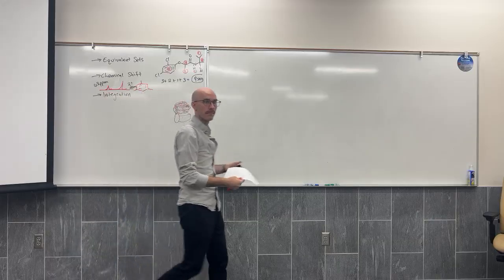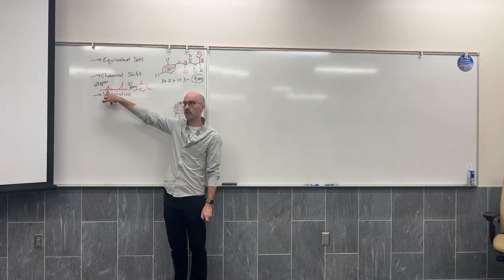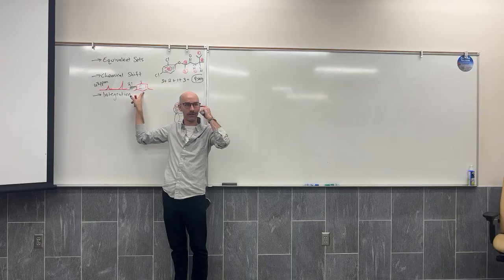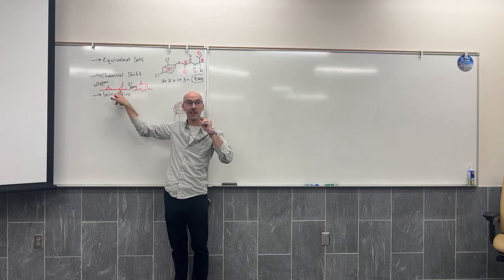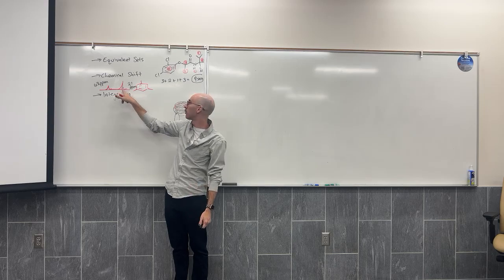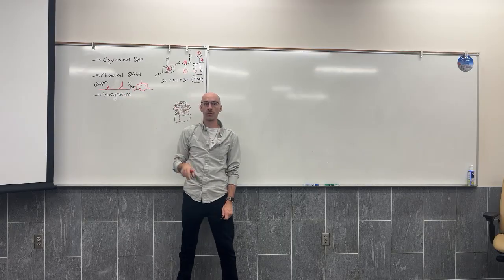Would the 6.8 be the hydrogens that are connected to the carbons in the aromatic ring? Good. This signal is produced by the aryl hydrogens because it's in range for the aryl hydrogens. And this signal? The methyl group hydrogens, which are functional group adjacent. They're adjacent to the aromatic ring, which is why their signal is not close to 1, their signal is past 2. That agrees with your correlation table saying that it's functional group adjacent.